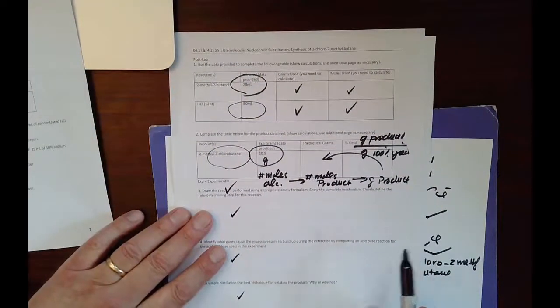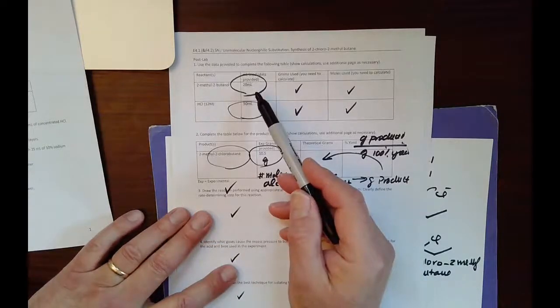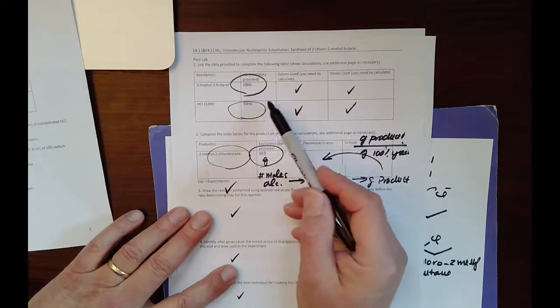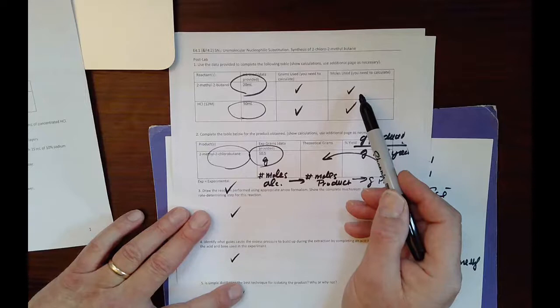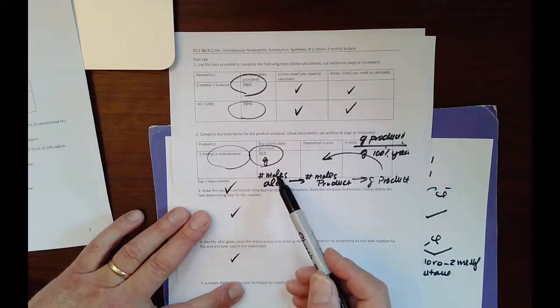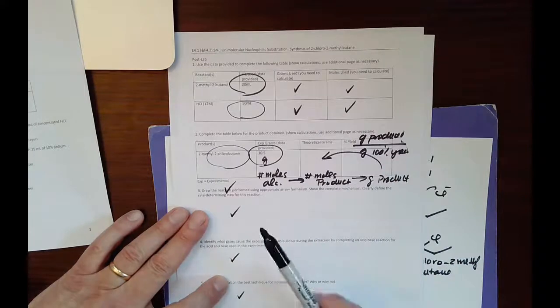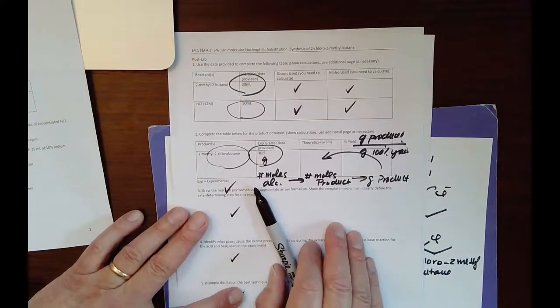we have the numbers, right? How many ml of alcohol we use, how many ml of acid we use. And based on that, we fill out some form here. Then I propose that we collect 10.5 grams of the product and we report the yield. And then a couple questions here to answer. So this is for the SN1. It's very easy, 2 pages, fill it out. Of course, look at the introduction and take a look at the video that I have there for you to look at. Thank you.